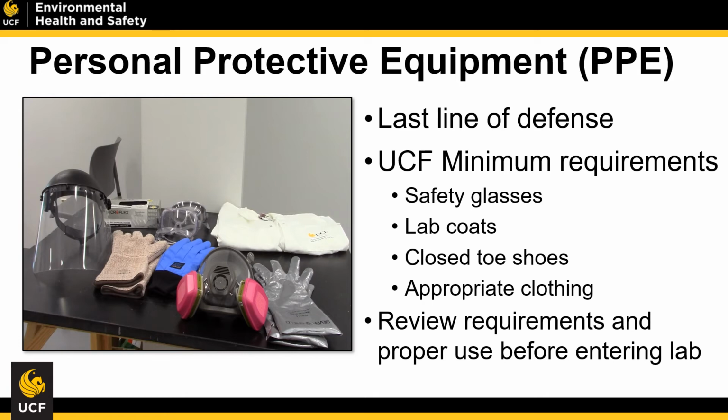Lab coats come in a variety of different shapes and forms, lengths, and types. Lab coats do need to be selected based on the work that you're doing. So if you're working with flammable solvents, a synthetic lab coat's not a great option, because when that lab coat burns, it becomes molten material and adheres to your skin. No one wants skin grafts, so make sure that you're choosing the lab coat that's appropriate for your use.